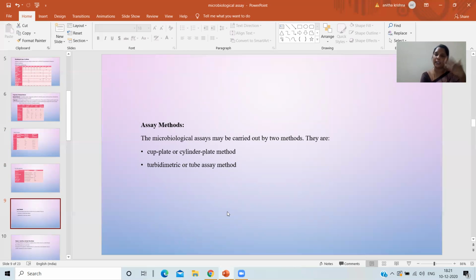The second procedure is the same as above, but after addition to the Roux bottle, you incubate it for 5 days and wash with 50 ml of saline solution. Then you heat it for 30 minutes at 70 degrees. Again, wash the spore solution 3 times with saline solution, and again heat the stock solution. The procedure is repeated, and after sufficient heatings and washings, you separate the test organism solution and store it under refrigeration. This is how you prepare your inoculum.